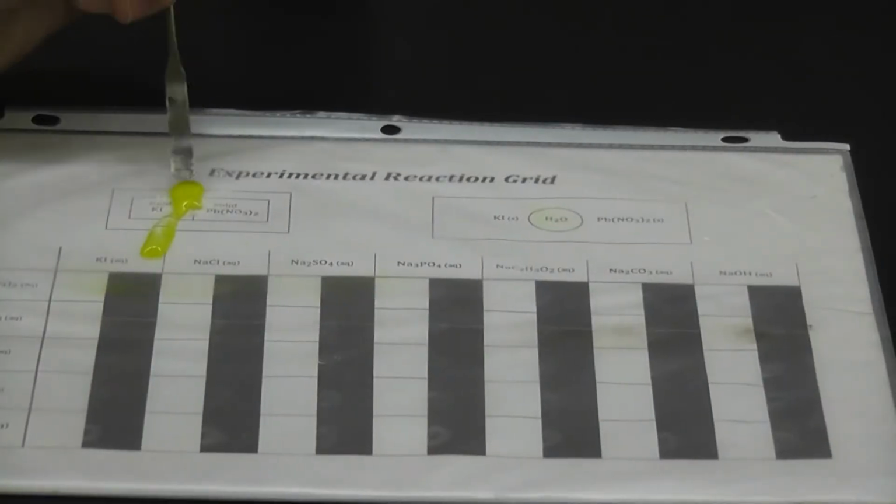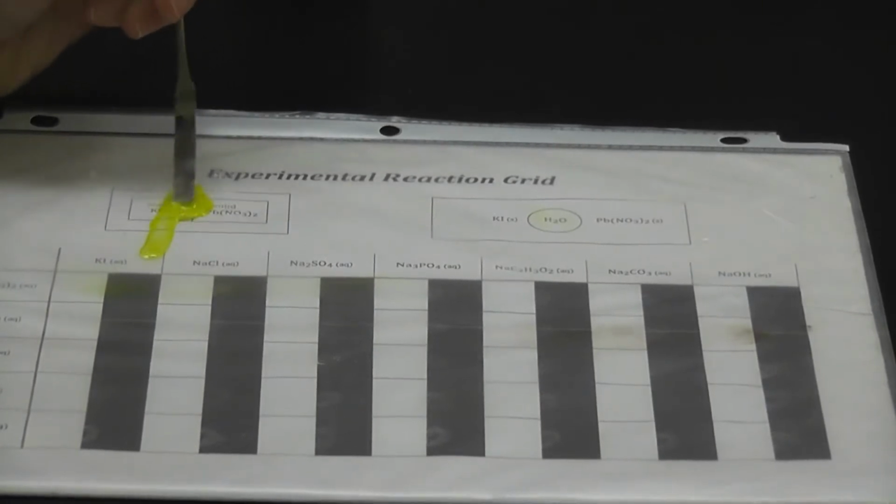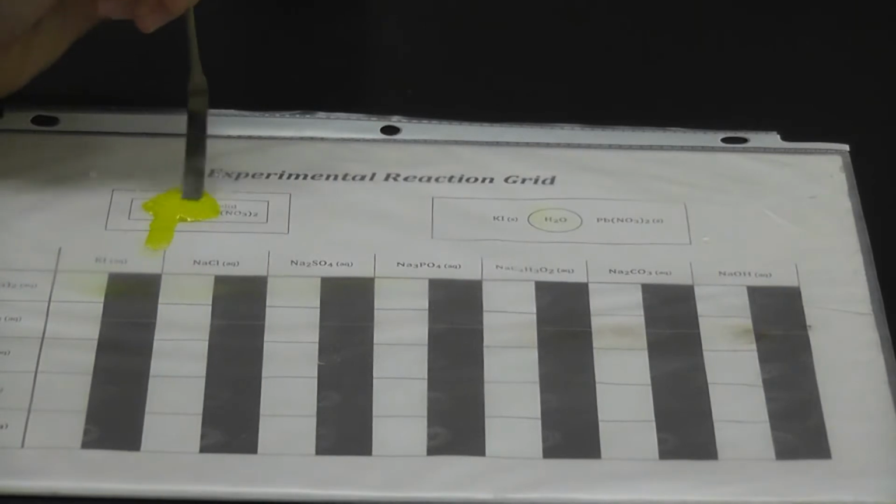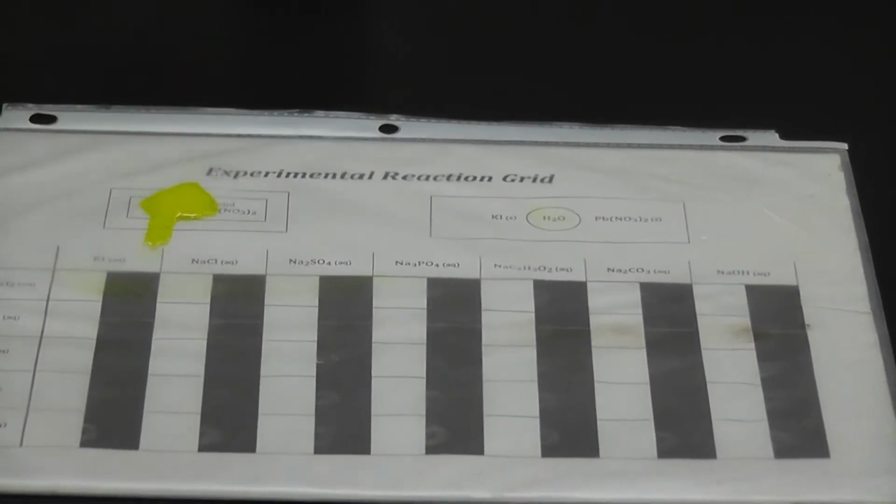Okay, so now we stir this after observing a little bit and see what happens. You can see it stays pretty yellow.